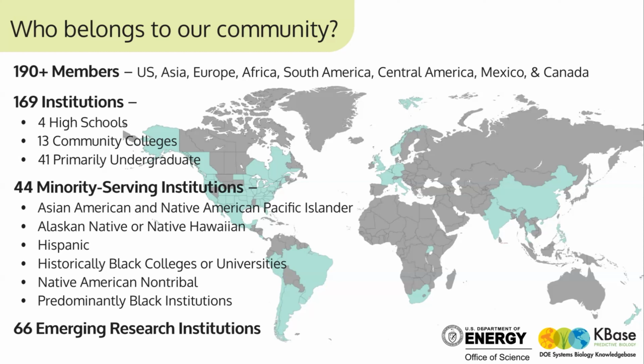This is not a question, more a comment. I'm a community ecologist, and I'm glad that from the DRAM outputs you can get different files where you can do things like alpha diversity, Shannon and richness. But while it's great to expose students to such a platform, they also need to learn to do some descriptive stats and that kind of thing.